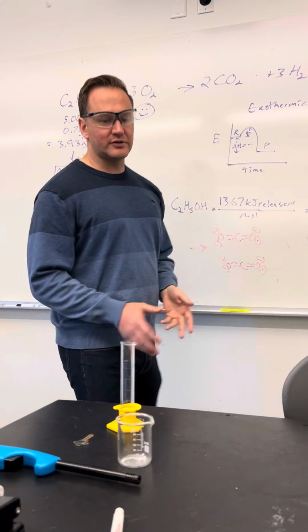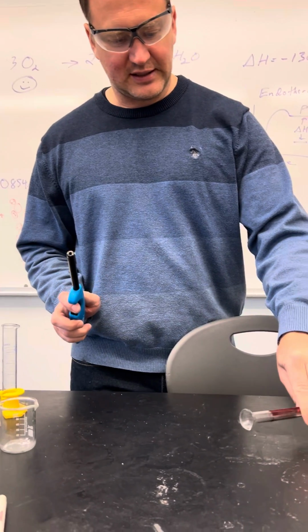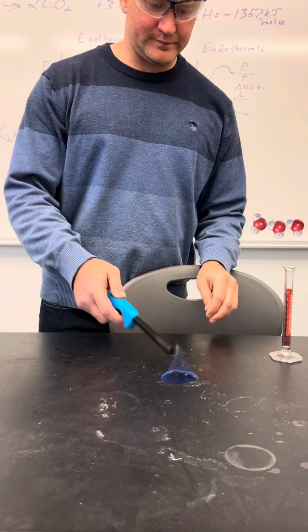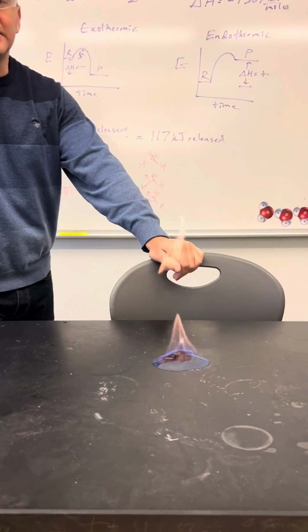The energy also gets released in the form of light. And you'll see that right now as I take that ethanol, make a little pile of it, and then I burn it. Okay? And you can see that energy getting released.